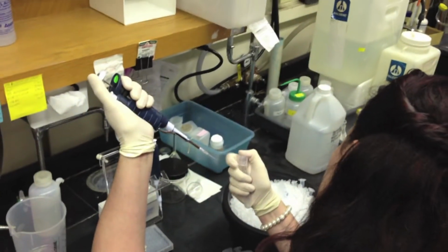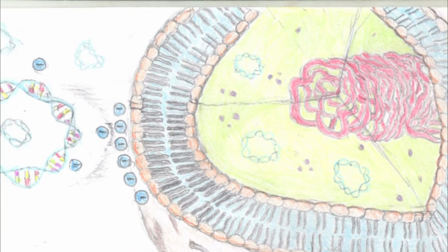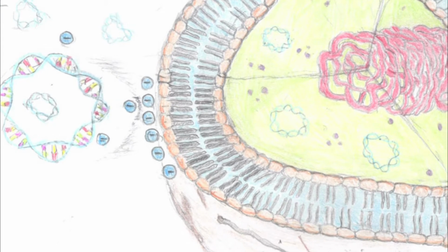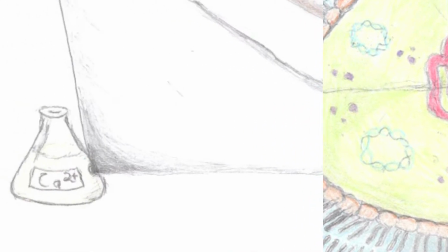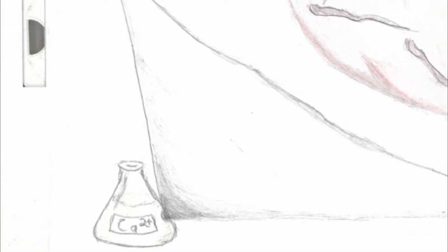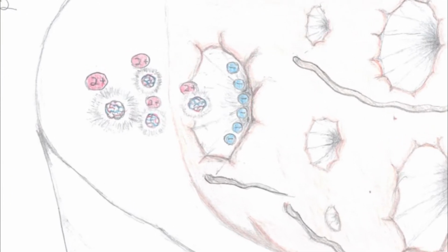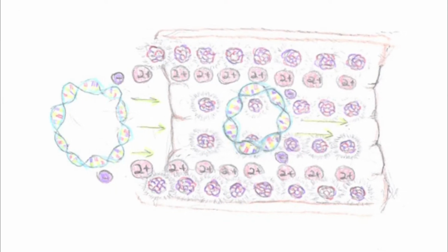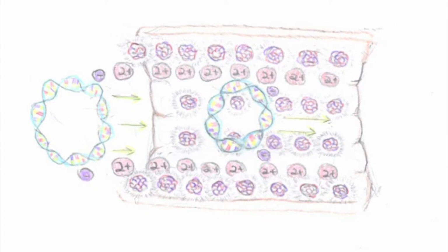The DNA molecules and the phospholipids of the bacterial cell membranes are both negatively charged. Electrostatic forces are therefore likely to prevent entry of the DNA into the cells. However, the divalent cations, meaning ions with two positive charges, present in the cell suspension may interact with the negatively charged phospholipids, coating the cell pores. Channels into the cells are thereby created, lined with positive charges, which attract the negatively charged DNA molecules.